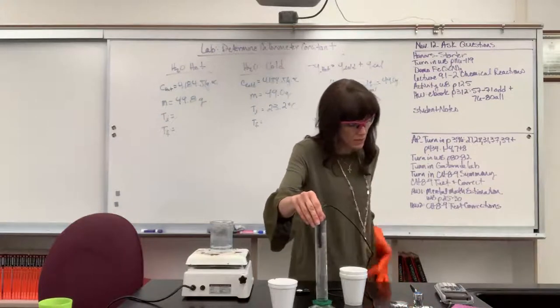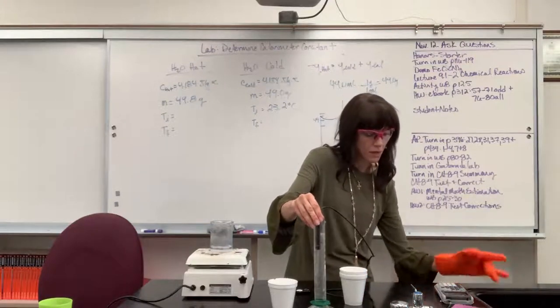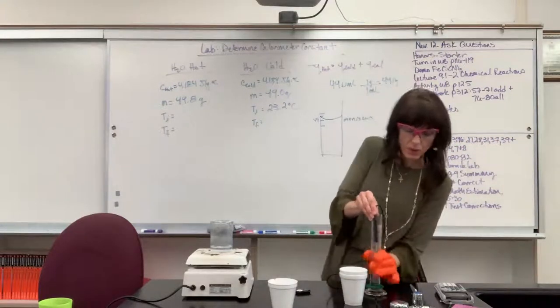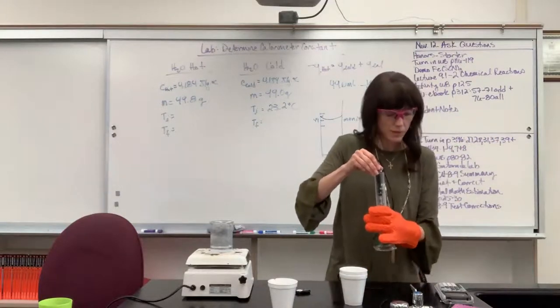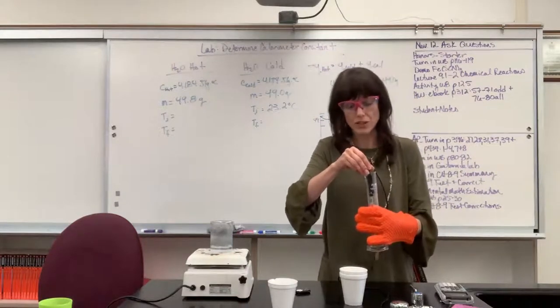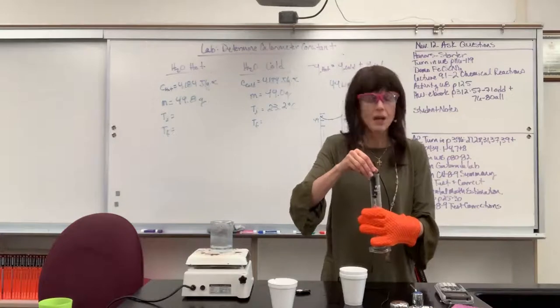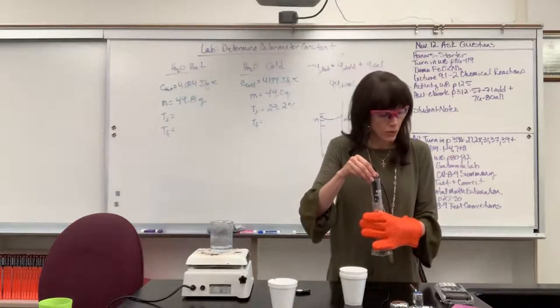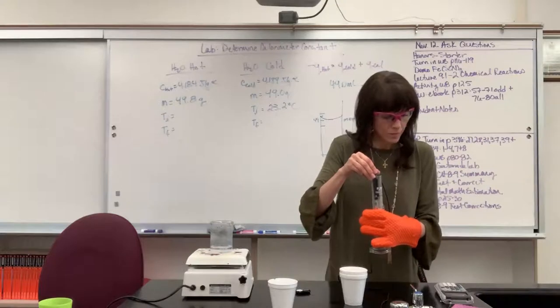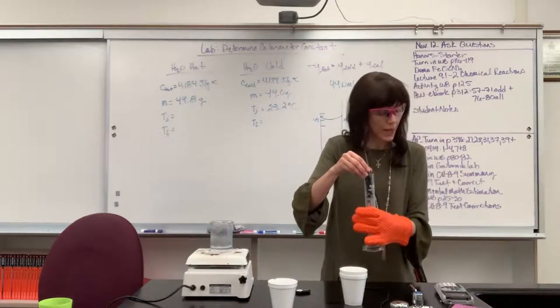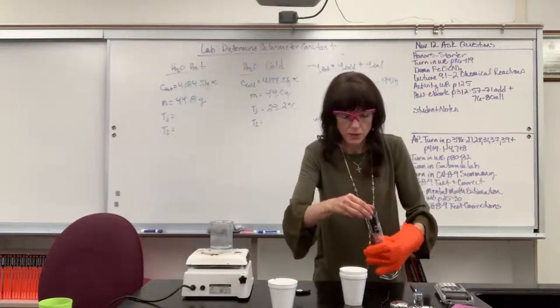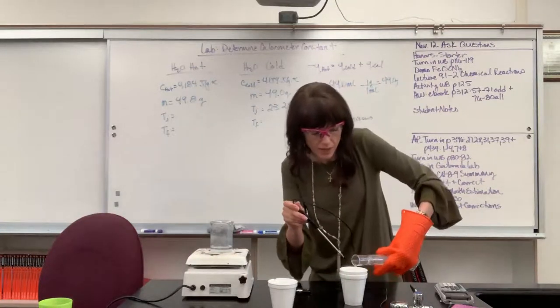So it's sitting, sitting, sitting. It's climbing. It's still climbing. I wait until that is stable. And notice, I'm going to pour with the glove. Because this is hot, if I use my bare hand, that hot water would go rushing past the glass where my hand's holding. I don't want it to get burned. So use the glove. Use the glove to pour. Okay, we are stable, and it is holding at exactly 73.0. Okay, so I quickly take this out, pour that in.